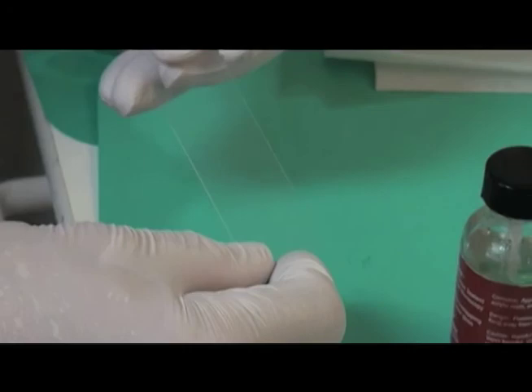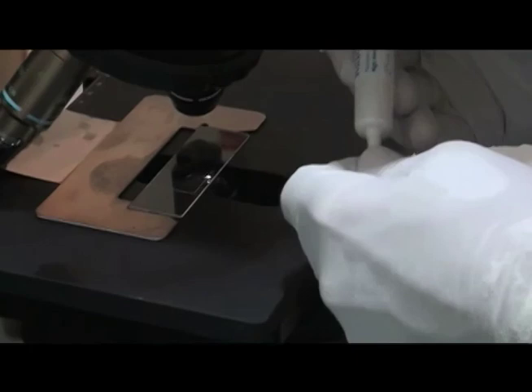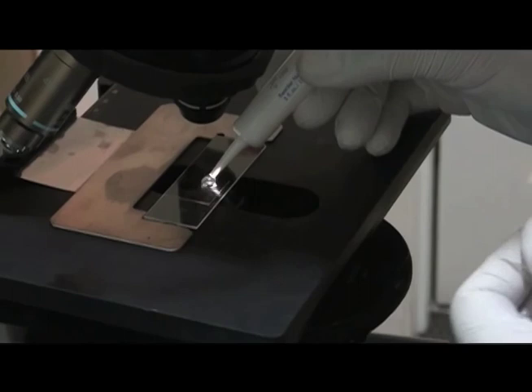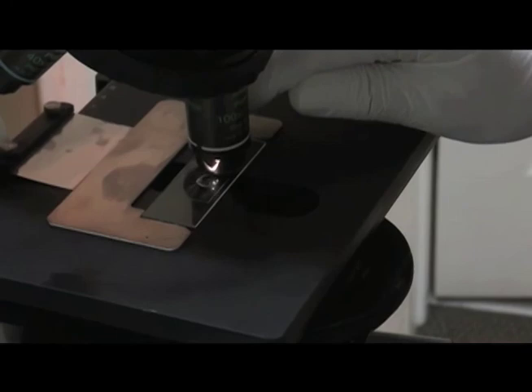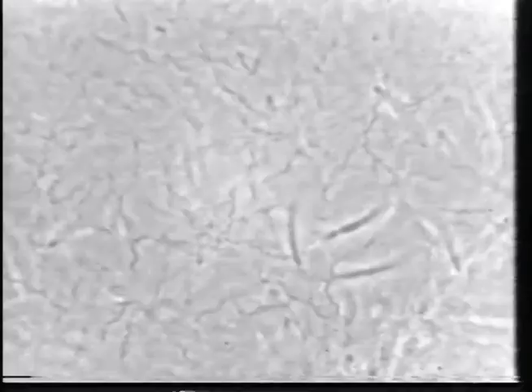This seals it off, and so we have our sample — it's all sealed and ready to go into the microscope. We slide it in and then put a little bit of oil immersion oil on the cover slip because we're working at 1000 power with phase contrast and oil immersion. Here's our microscope setup with an 18 megapixel high definition camera to a high definition screen at 5000 power. Here's an example of little spore-like forms in the epithelial cells. As we move around we see a lot of spirochetes moving very fast and furiously — we consider this a very virulent case, so we treat with heavy duty antibiotics and laser surgery.